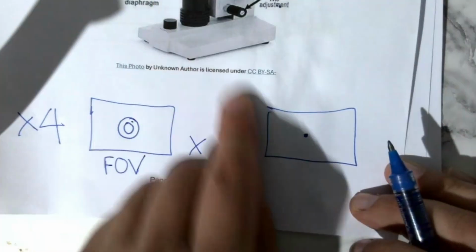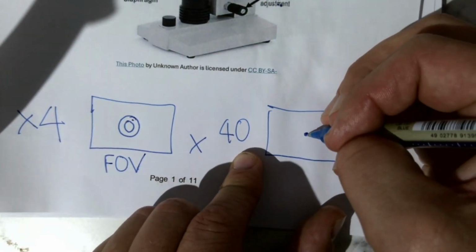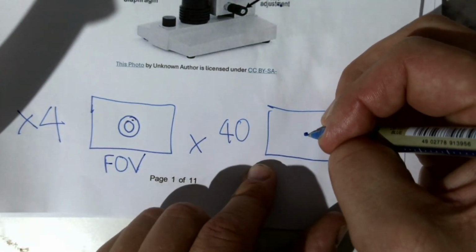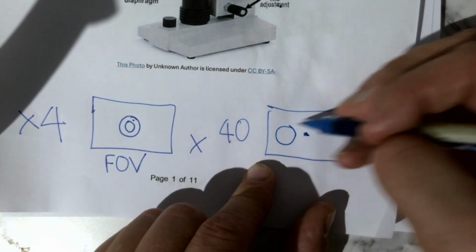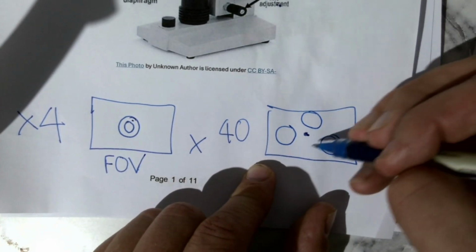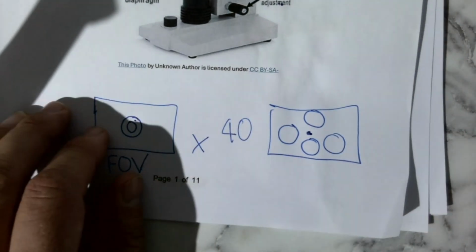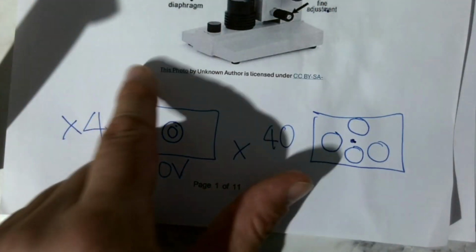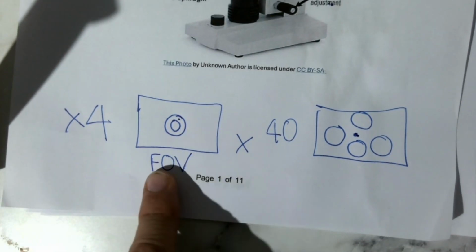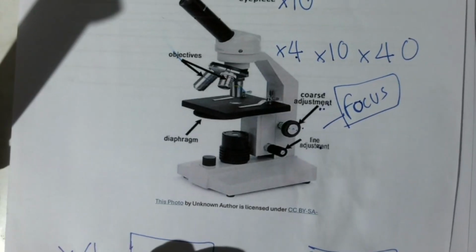But if you were to start on 40 times 10, 400, the specimen may be so small, this is 400 magnification, that you may be looking here, here, here, here, and you've yet to find the specimen. So we always start on the smallest magnification, change the magnification once you've found your specimen in the widest field of view, and then you change the objective lens.